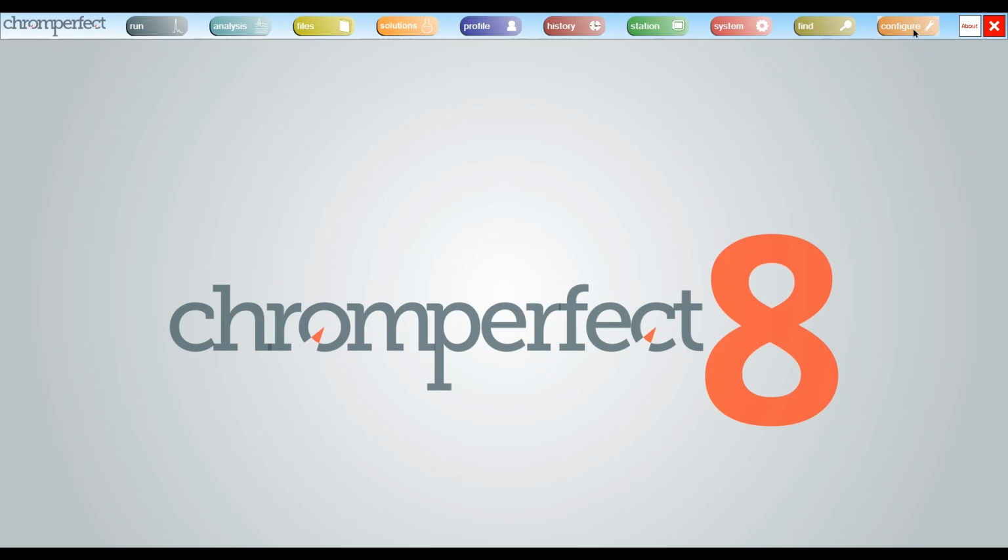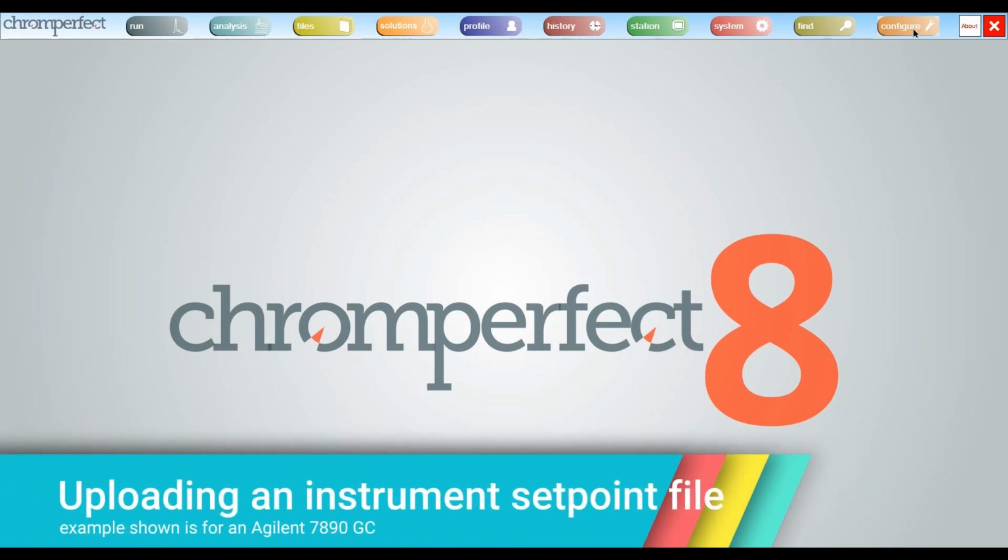Other software versions and operating systems may be a little different, and you should consult your user manual for more information. We are going to look specifically at the initial setup of an instrument control setpoint file, as this can sometimes seem confusing to new users.